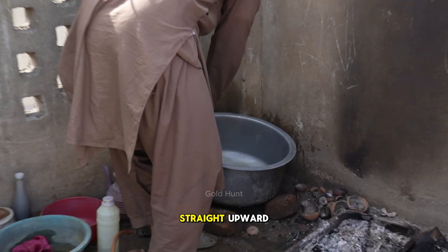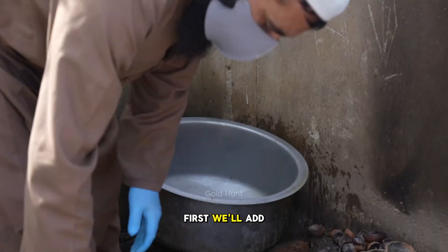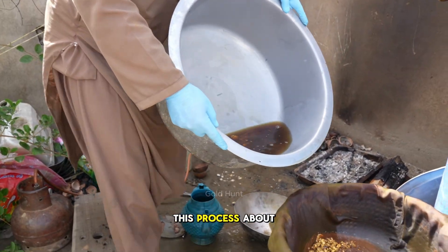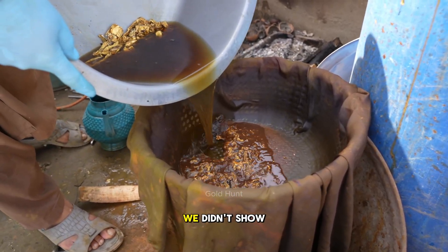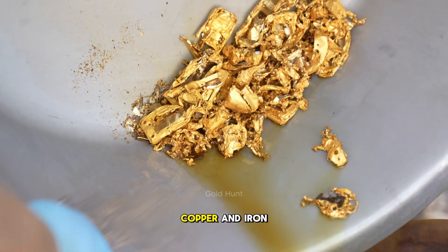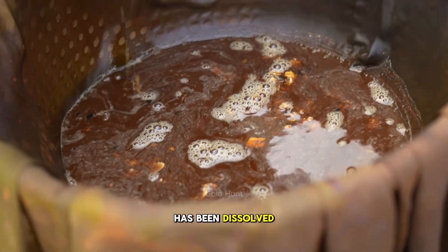Let's close the lid and make sure to keep the fire going. The flame helps the fumes rise straight upward. First, we'll add water and then carefully drain it. We've already repeated this process about six times — we didn't show every step on camera. After six rounds, all the metal — brass, copper, and iron — has been dissolved.